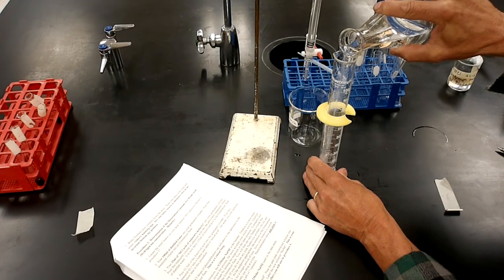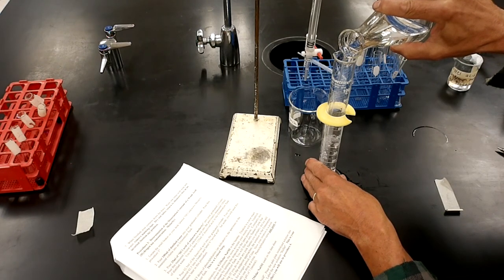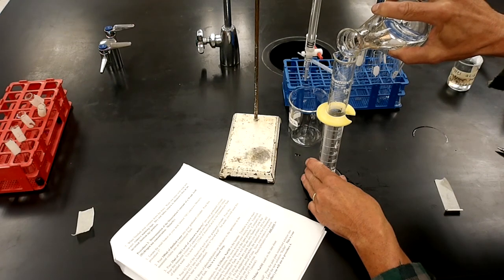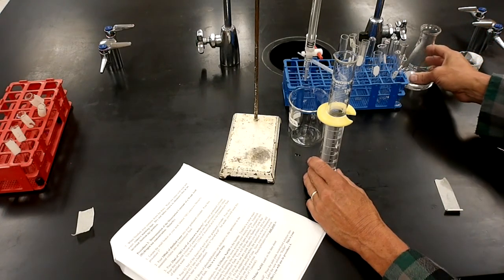So I'll use the graduated cylinder to get 62.5, as close to it as I can. Very close.